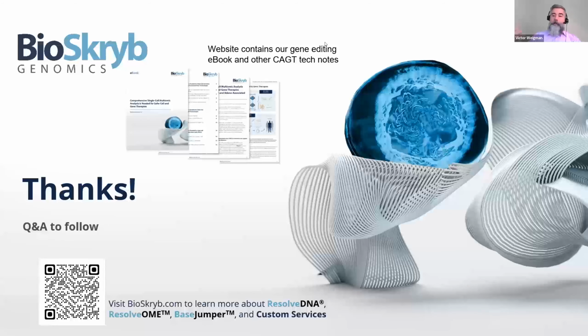As I mentioned in the detail earlier, we could use reporters. We could use things like flow cytometry to do that selection going forward, but this was just random selection of cells. But we do find a lot of power in using those reporter and phenotype mechanisms for your cell selection, so you're having to do fewer cells randomly.